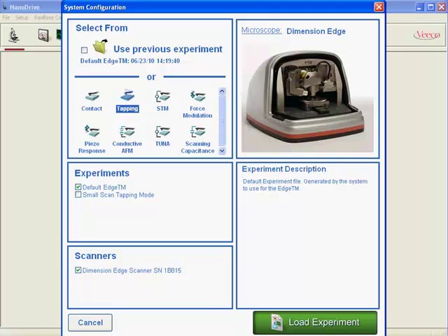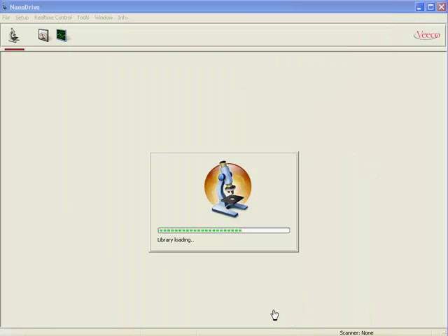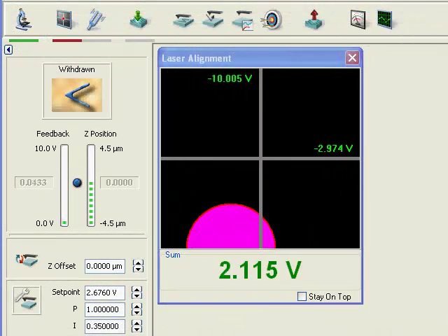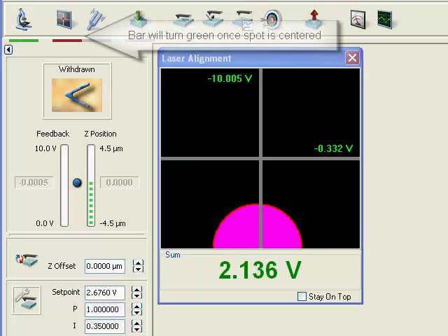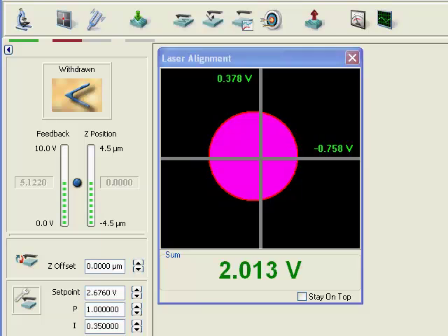In this case we select a simple tapping mode experiment. The settings are now loading. On the top you'll see the experiment guidance. We start with laser alignment — here we see a representation of the photo detector and we are aligning the laser on the scan head, moving the purple dot into the center of the detector. At the same time the green bar under the laser alignment icon switches from red to green, indicating the alignment is perfect.